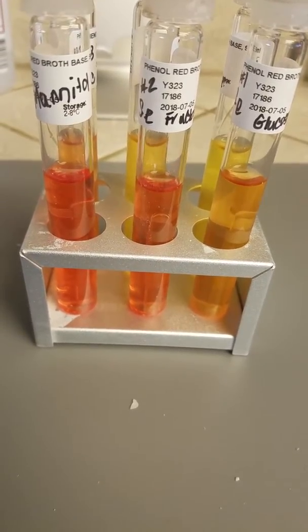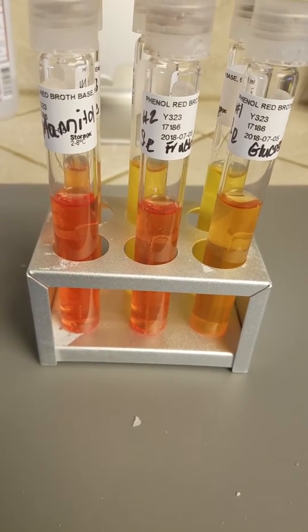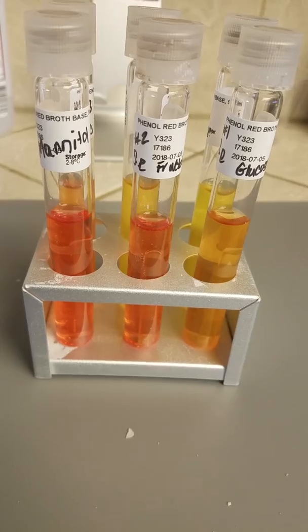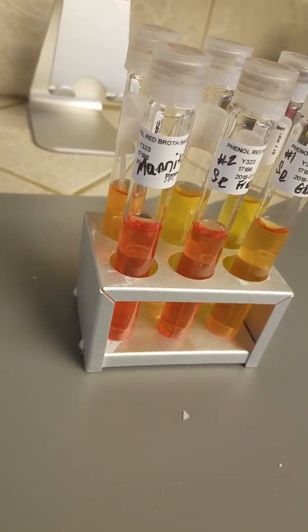But this morning when I left for work after 12 hours, they were all just pink so there was no change after the 12 hours. So here they are.